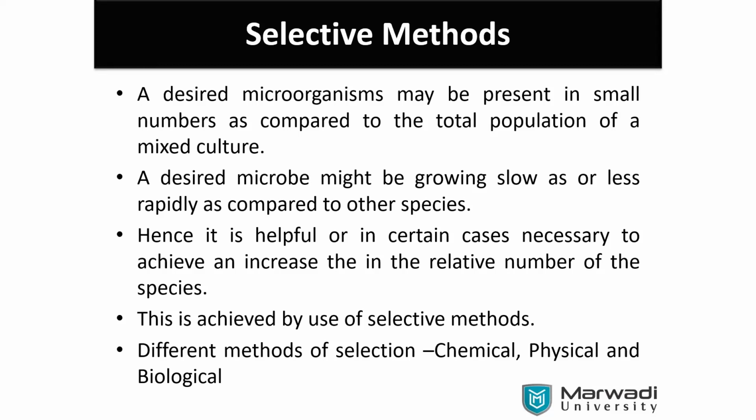Yes, this one is particularly, if I'm not wrong, it may be Aspergillus niger.